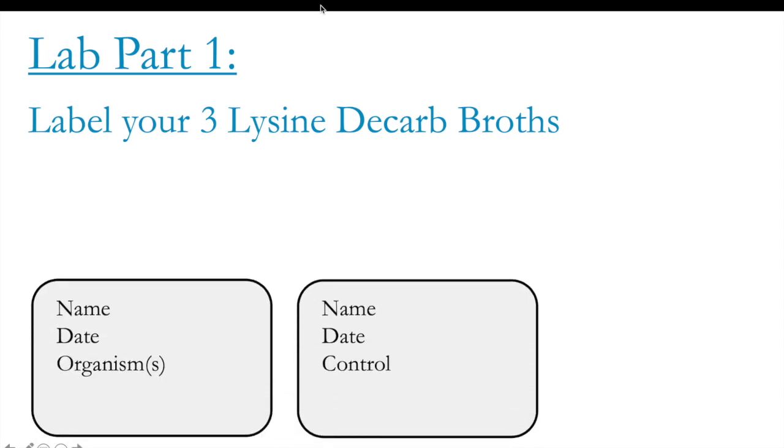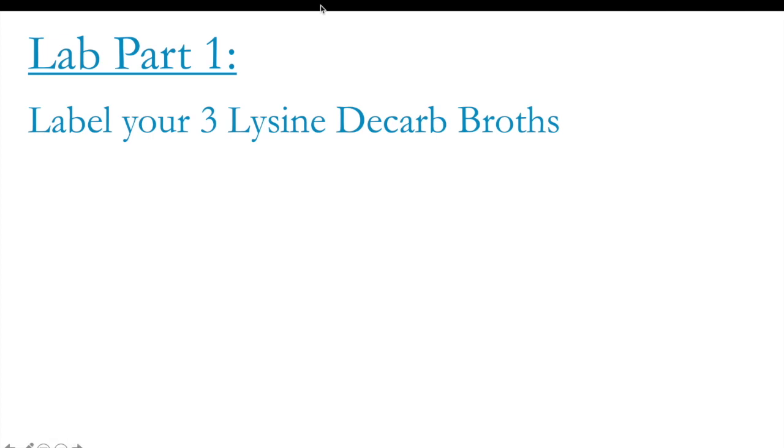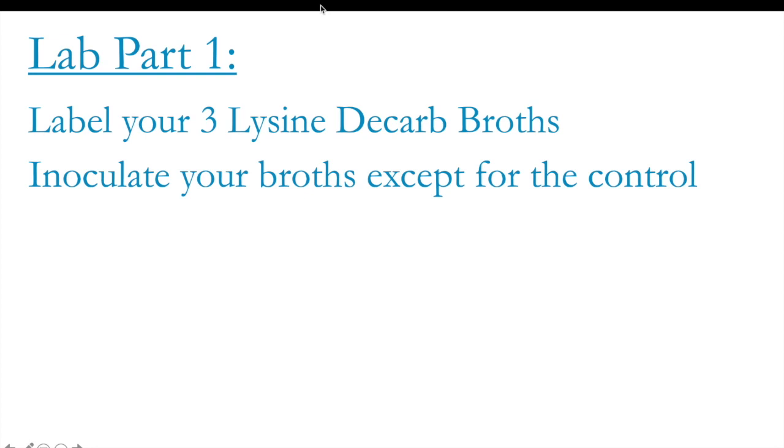Now that you have all your items gathered, first thing you'll want to do is label your 3 lysine decarboxylase broths. Two of them with the organisms that I've mentioned earlier, and one being your control. Once you have labeled all of them, you can then proceed to inoculate your broths, excluding the control for obvious reasons.